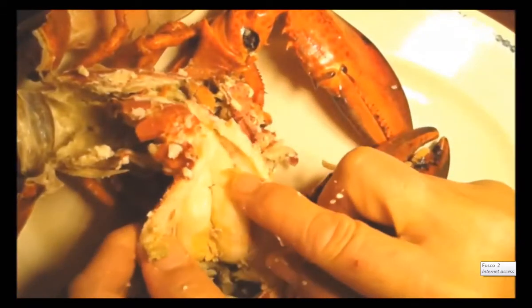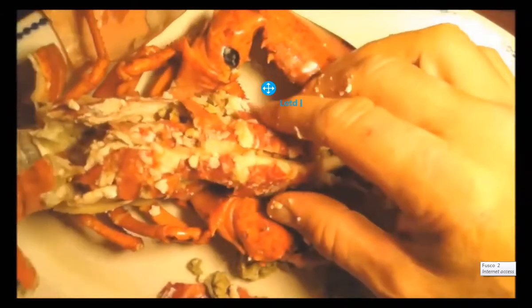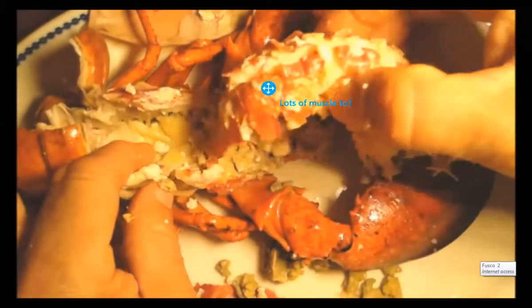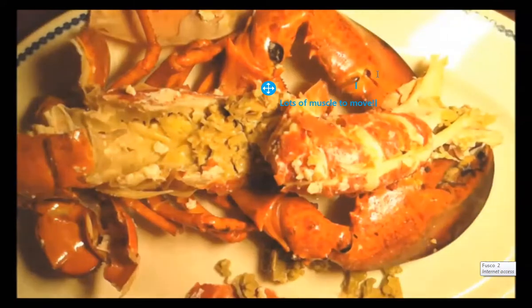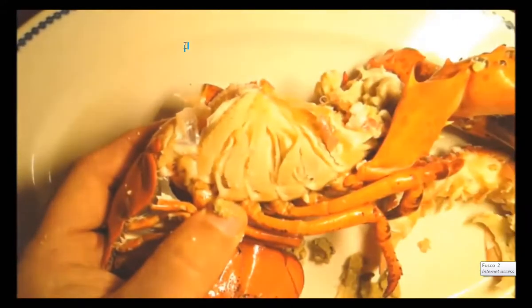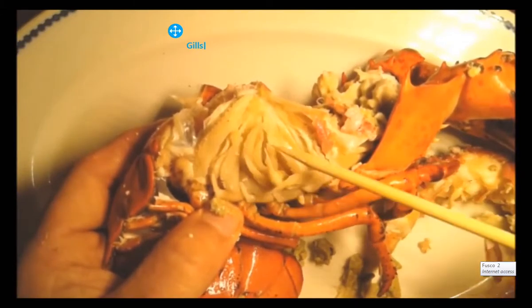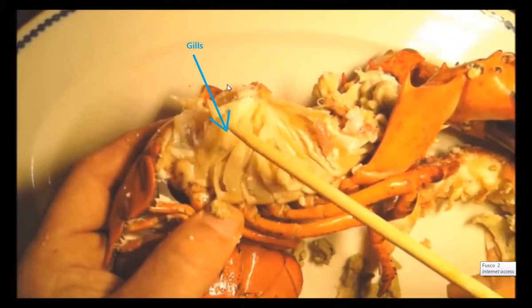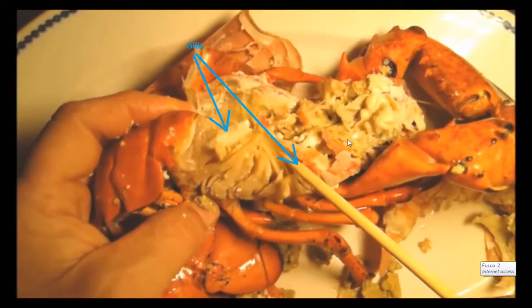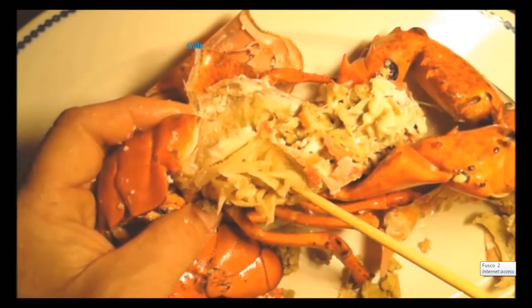Most of the abdomen is made up of muscle that allows the lobster to snap his tail and helps him to escape from predators when he's smaller, and helps him to move around. These delicate feather-like structures are the gills — this is how he breathes, directly underneath his shell. As the water passes by, these extract the oxygen from the water and provide the circulatory system with oxygen.